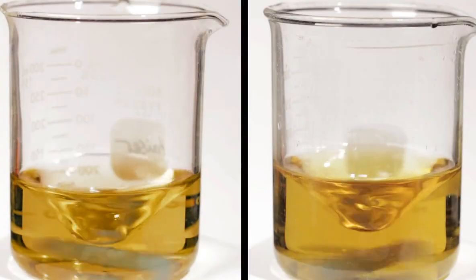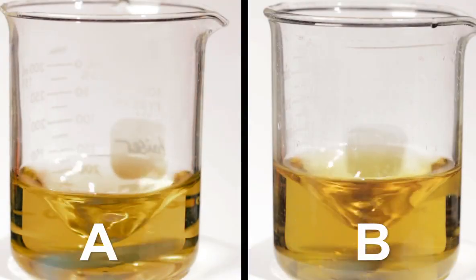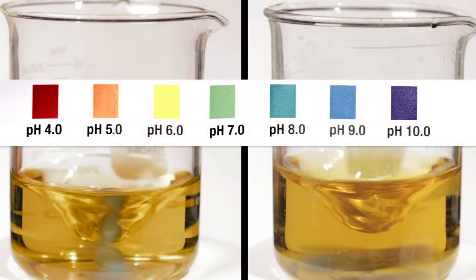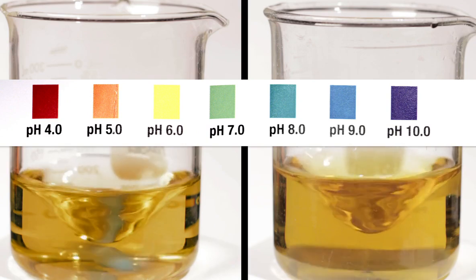Here are two solutions, A and B, to which I've added universal indicator. Here's the color key. As you can see, both of these solutions are around pH 6, or very slightly acidic.